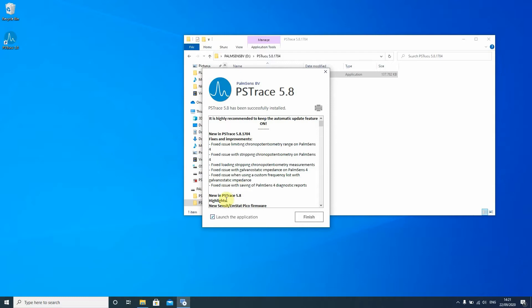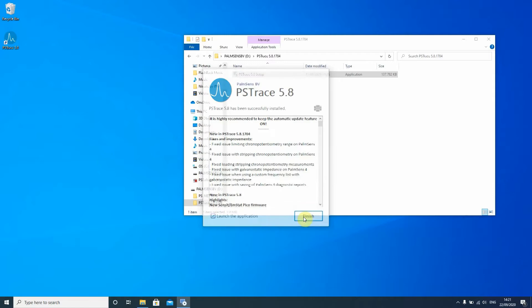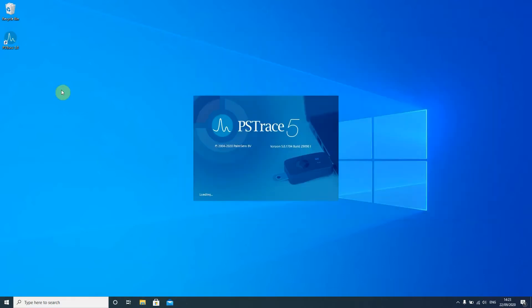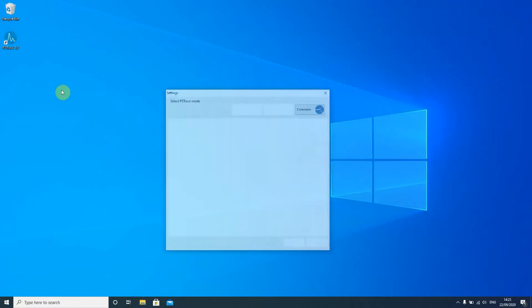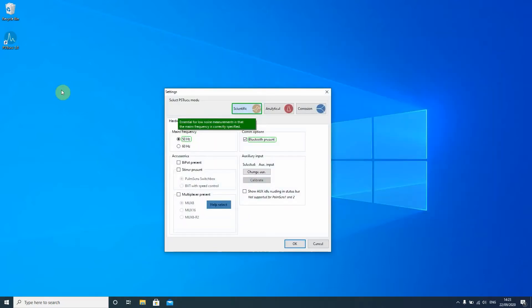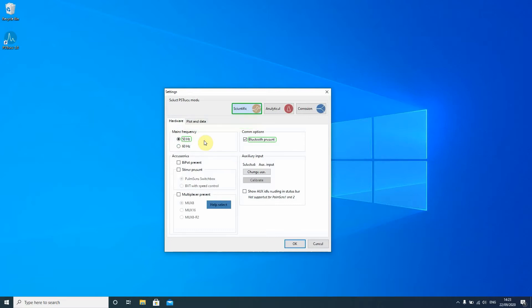If you leave the check here you will launch the application when you press finish. PS Trace is loading and when it opens for the first time the settings window will open and there you can make some simple choices but you can change them later on so don't worry if you think you ticked the wrong box.